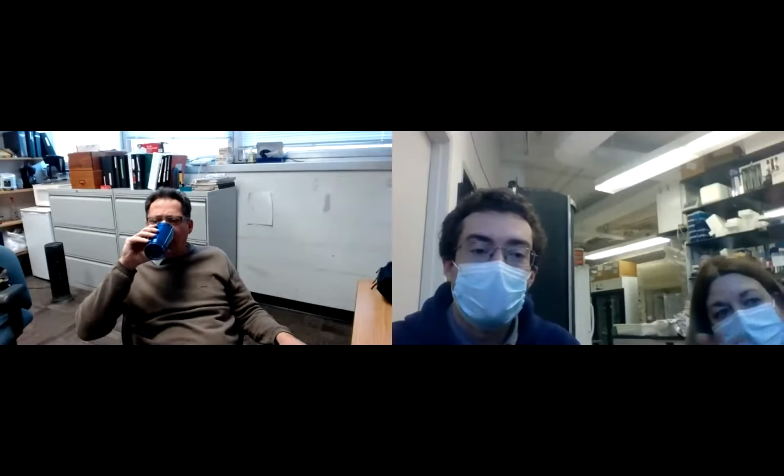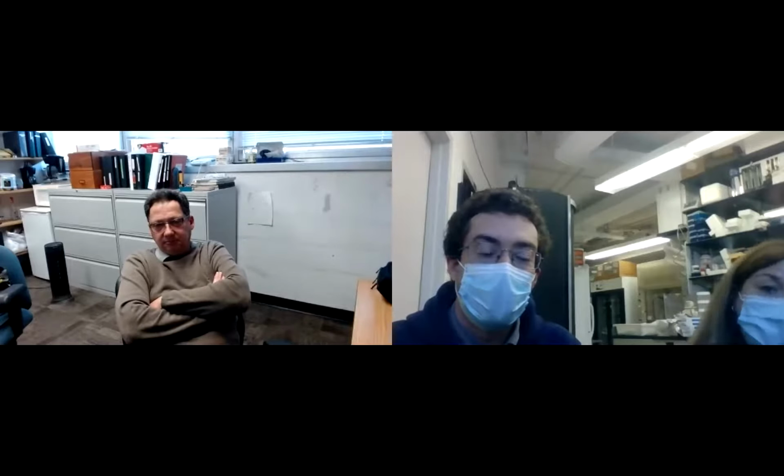Yeah. When we start taking pictures, we look at different ice thicknesses, take pictures, and look at the quality of the microtubules at that thickness. Once we determine where the microtubules look the best, we then aim for an ice thickness similar to that one. We do that when we do the atlas and the whole assessment of the grid, and we do it with you guys, I mean, whoever is helping us at the microscope.